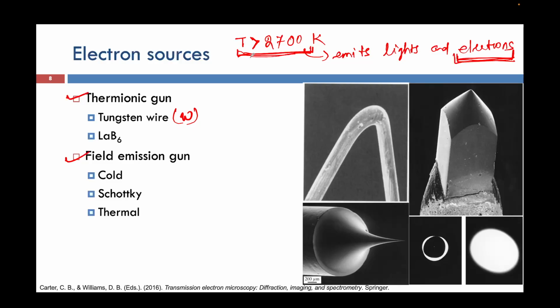Because one of the major criteria we have noticed is brightness. If you remember, brightness is defined as beam current density per unit solid angle.